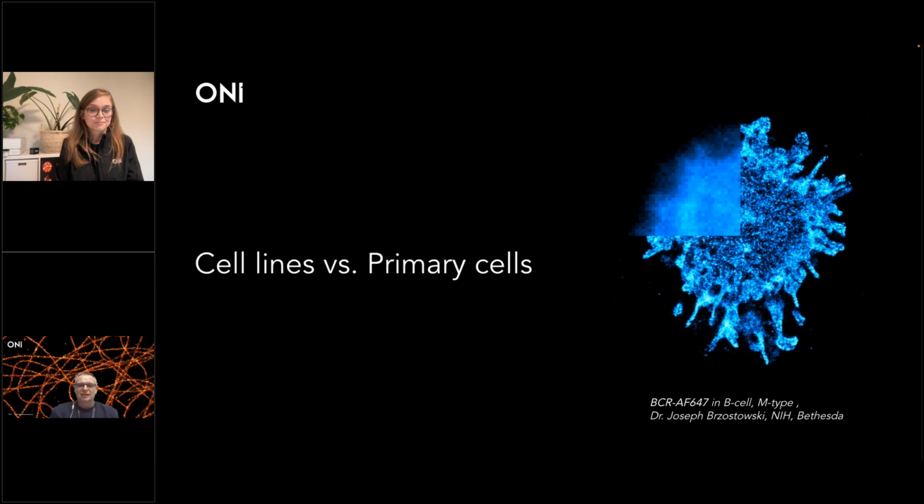The disadvantage of these technologies at some point is that if you have a live cell, you are encoding fluorescent proteins inside your protein of interest, and then you have it expressed in your cell lines, or you do overexpression, or you need to look at the receptors outside of the cell, because you cannot use permeabilization.